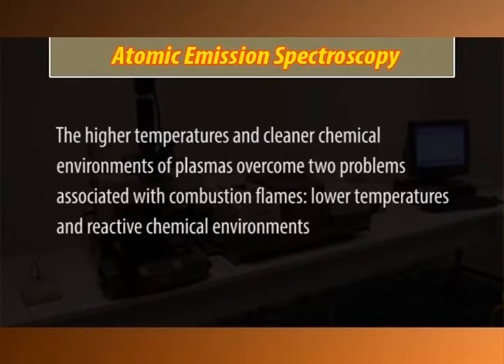The higher temperatures and cleaner chemical environments of the plasmas overcome two problems associated with combustion flames: lower temperatures and reactive chemical environments. Plasmas retain the convenience of liquid sample handling and the precision of excitation conditions characteristic of flame sources.